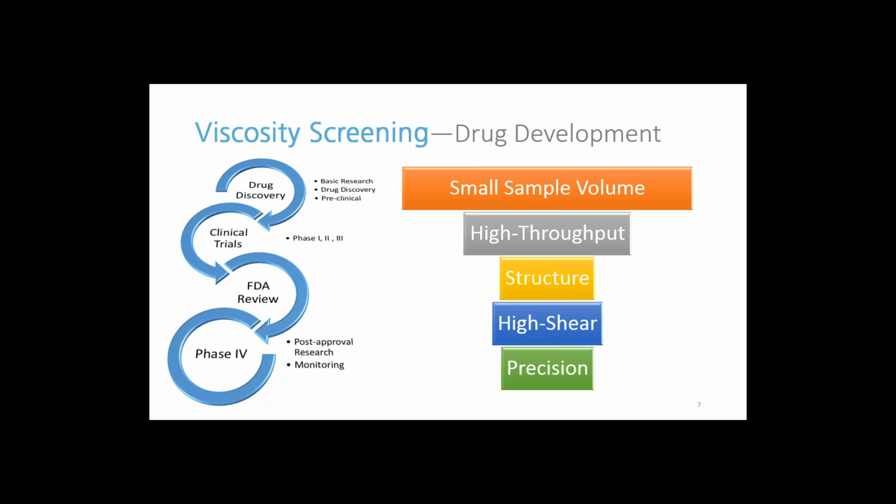In any way, during the whole process, going from the drug discovery to phase 4, after the drug has been approved, where you might want to use viscosity just as a quality control check, you're going to need a system that is able to give you an accurate, repeatable measurement of viscosity in a precise and easy way.